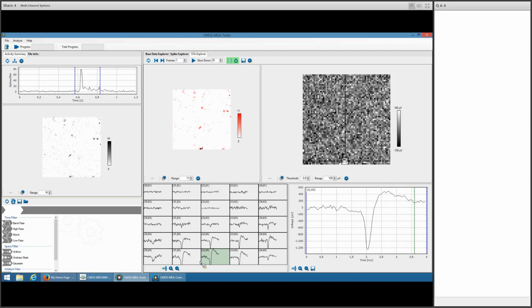It doesn't work with that specific spike now, but I've tried a few spikes and I've seen that sometimes you can really see, okay, here's the cell body, the action potential gets fired, and then you can see it moving along through the cell culture. We have a movie of that on the website where you can have a look. So that is at the moment what the software is capable of doing.